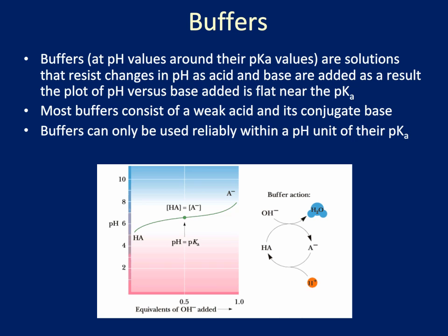You should already have a good concept of what a buffer is based on your general chemistry and biochemistry lectures. However, I will briefly highlight the terms and concepts that you should know for this laboratory. Also in the assigned readings is some refresher, and you can consult your biochemistry textbook for additional references.